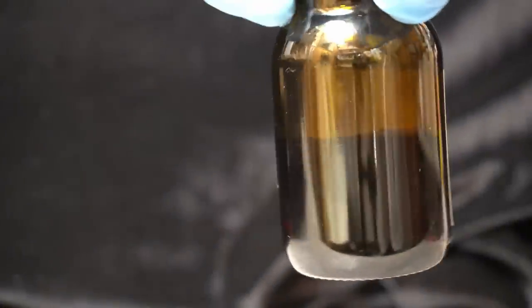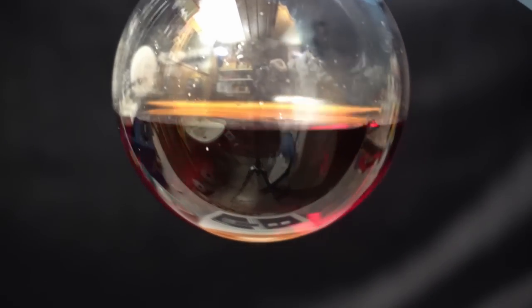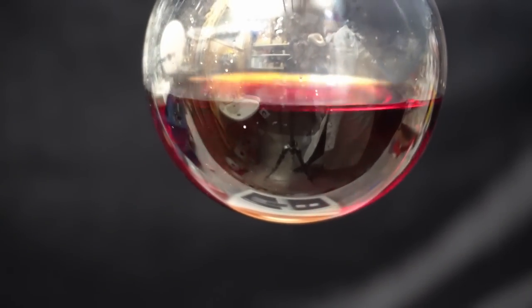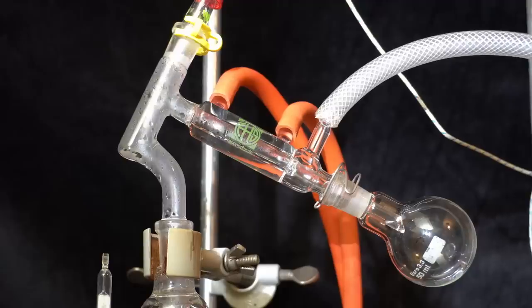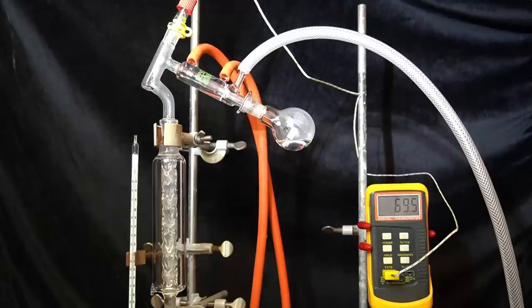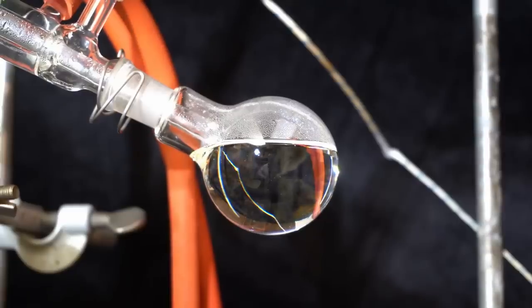Before I can start with the synthesis the aniline has to be cleaned up. During its storage time it has oxidized quite a bit and has turned into a deep red color, so I quickly perform a vacuum distillation. The distillate is completely colorless which you could say is the true color of aniline.